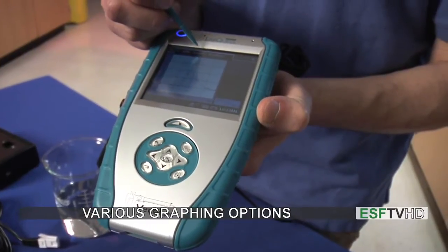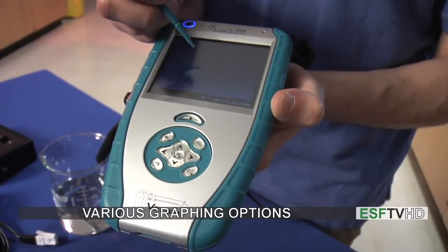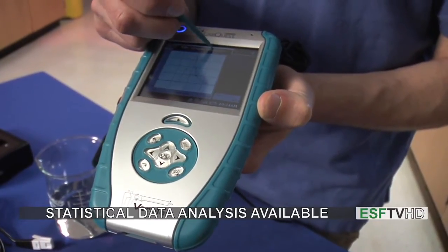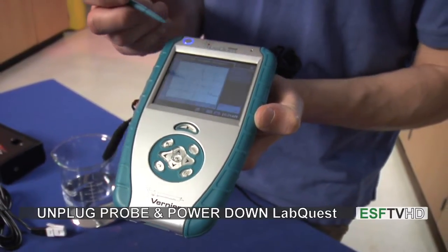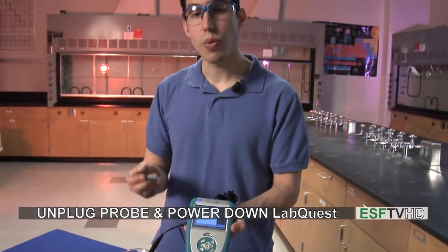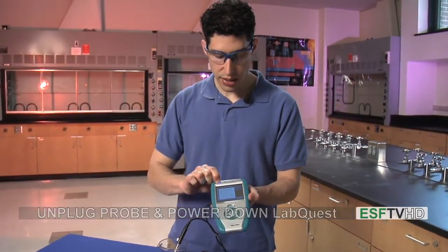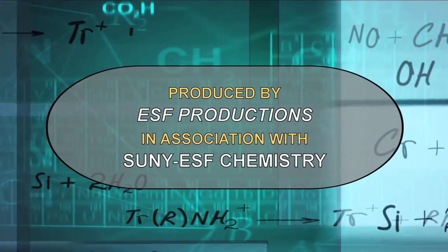There are also a few different things you can do in terms of graphing. You can choose to auto scale, you can change some options involving the Y axis values and what units are going to be used, and you also have some abilities to analyze looking at statistics such as maximum and minimum. So those are the basic functions on how to use the LabQuest. When we're all done using it, we just unplug the probe, turn off the power, and put it away. And that's how we use the LabQuest in the lab.